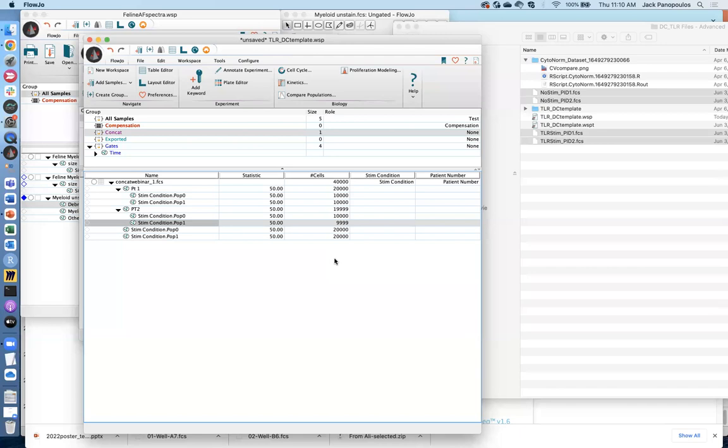I suppose if all the files are undercompensated or overcompensated in the same area, you're probably safe, right? Because you could say, okay, well, it's not just one file, it's all of the files that have this problem with compensation. So if they all are showing the same error in the same location, then you're going to have to do less work working backwards to figure that out.